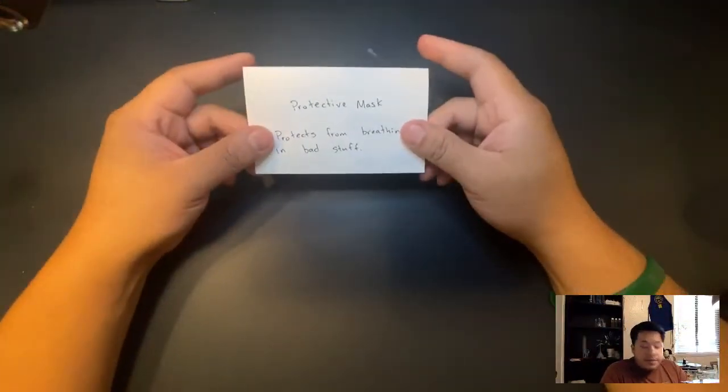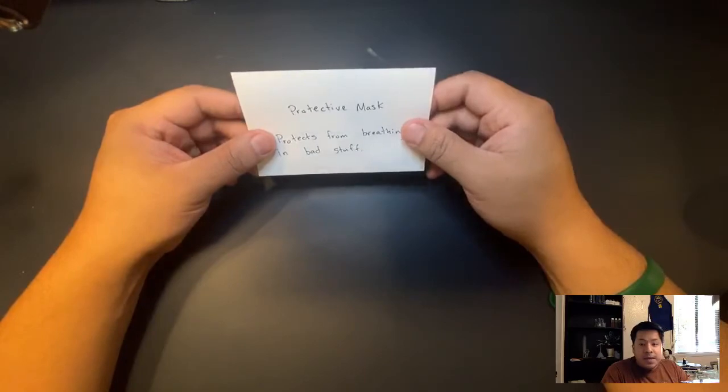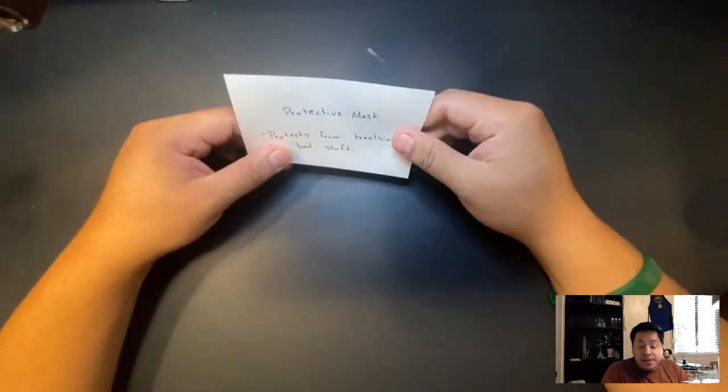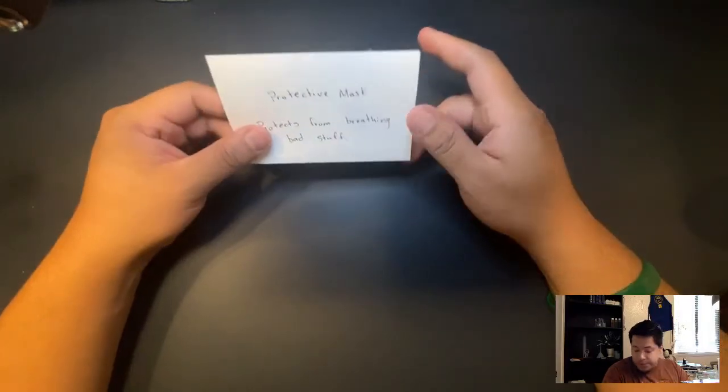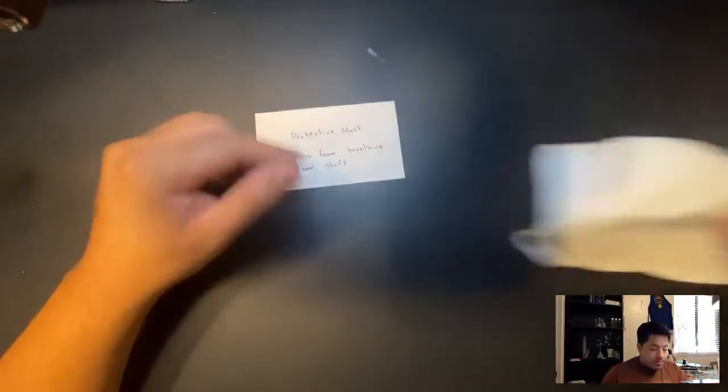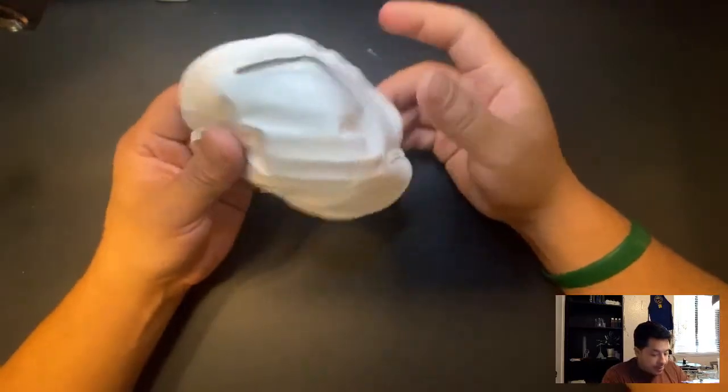Hey boys and girls, Mr. Gordova here once again. I'm bringing you guys another science video. This video is going to be about science lab tools.